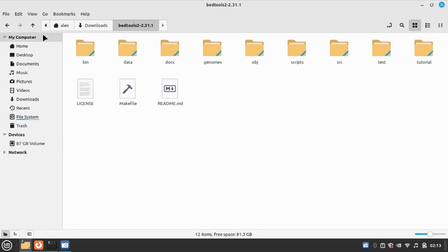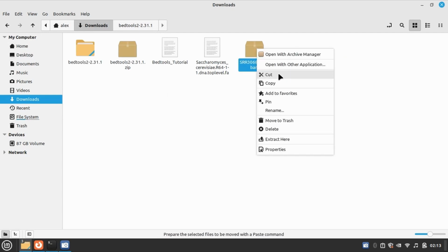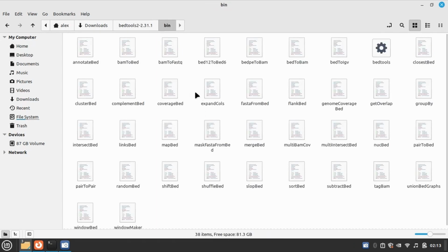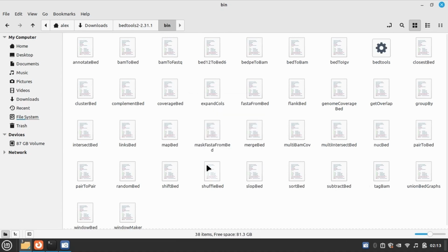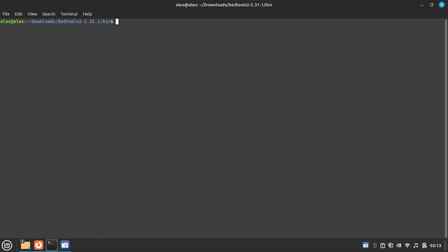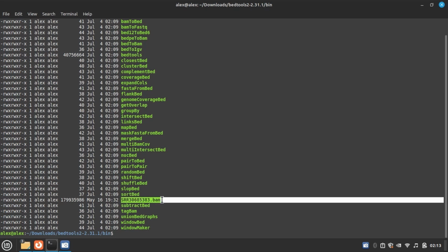So we have the BAM file here. Let's cut it and place it into the bin folder. Okay, let's check it. So here is the BAM file.